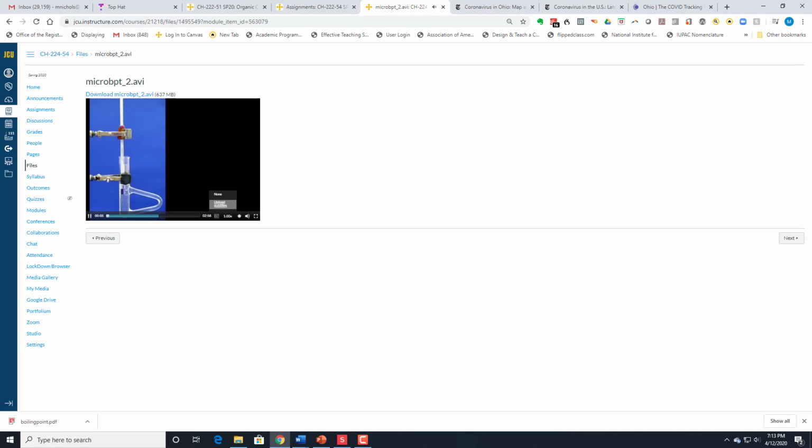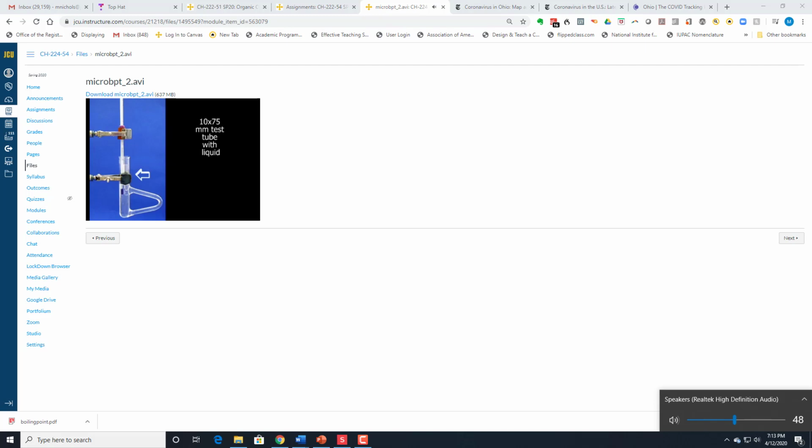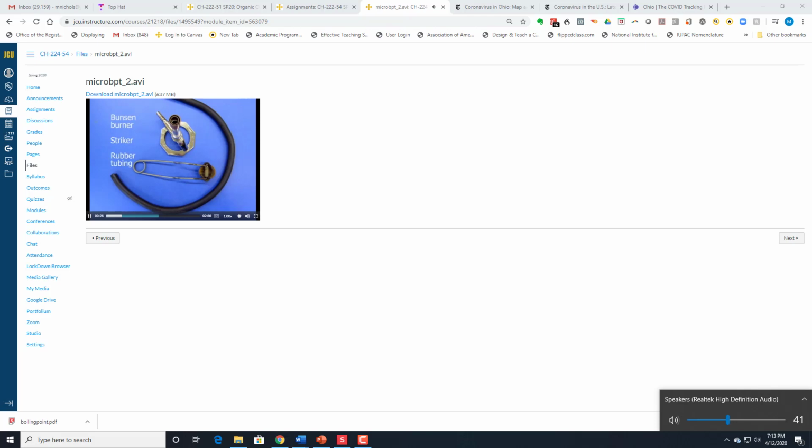The equipment needed in order to determine the boiling point of a liquid includes a Thiele tube with a high boiling oil, the level of which should be just above the Thiele tube sidearm. A small test tube filled with no more than 0.5 milliliters of your sample, and a capillary that is open at one end are also needed. A glass thermometer, which will be attached to the test tube with a rubber elastic, is required as well. The apparatus is heated with a Bunsen burner.